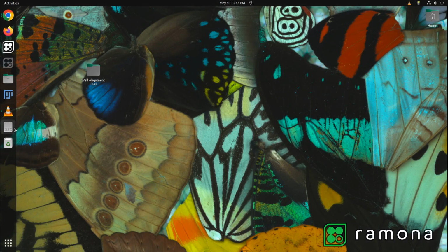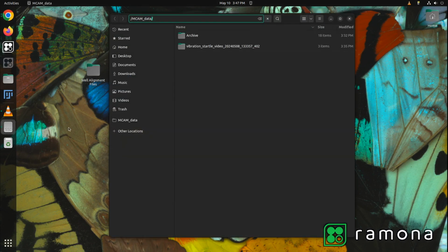To begin, let's navigate to the MCAM data directory where we saved the vibration startle video by clicking on the hard disk icon on the left side of the screen. Here it is, titled Vibration Startle Video with the acquisition timestamp appended to the name.